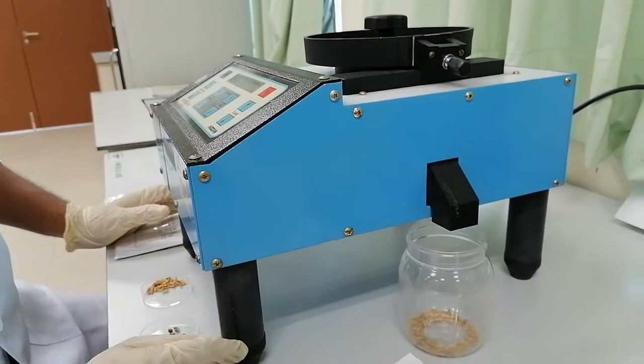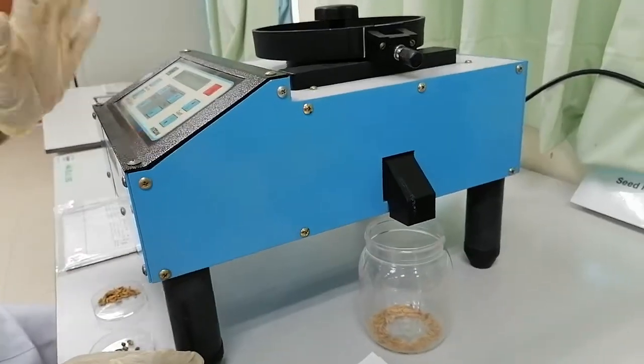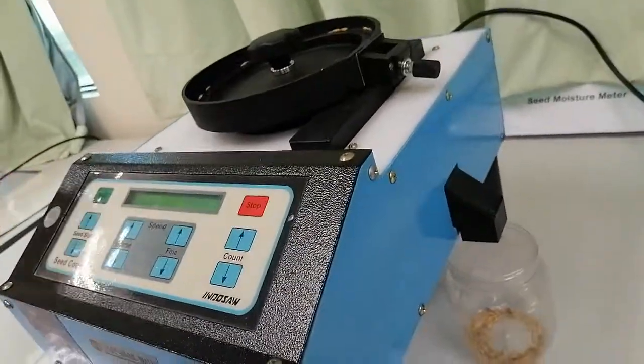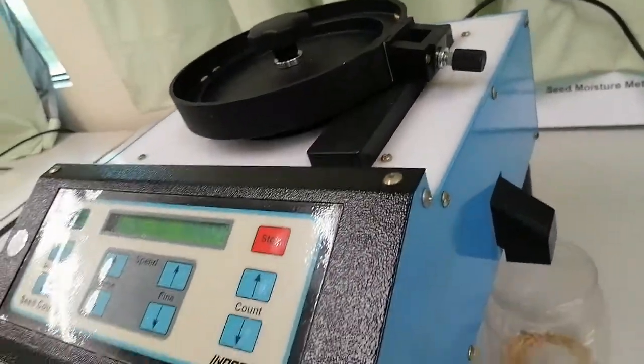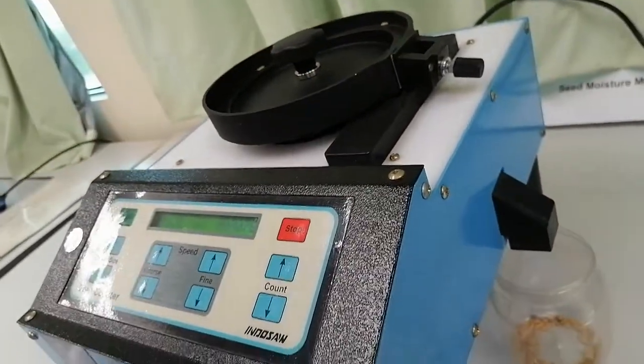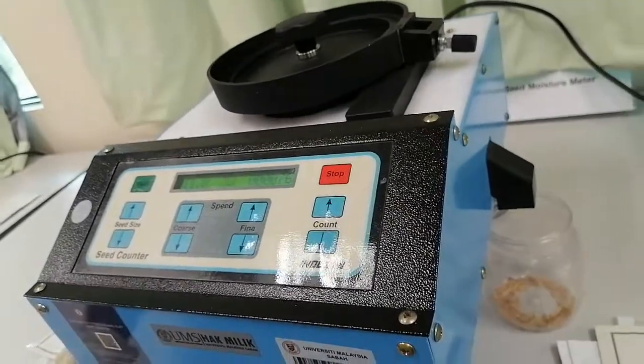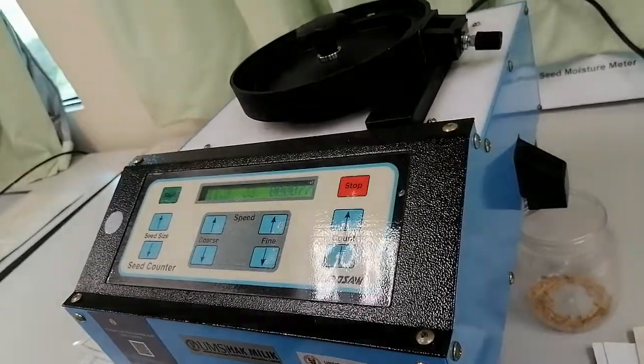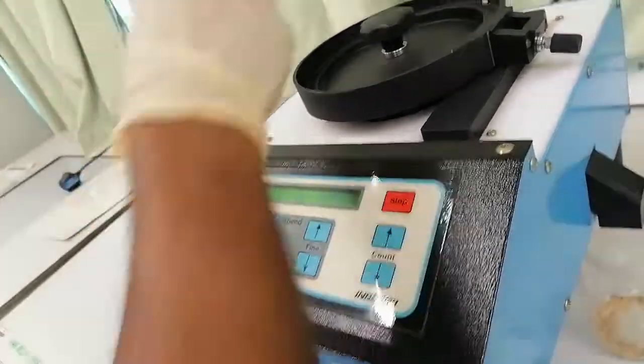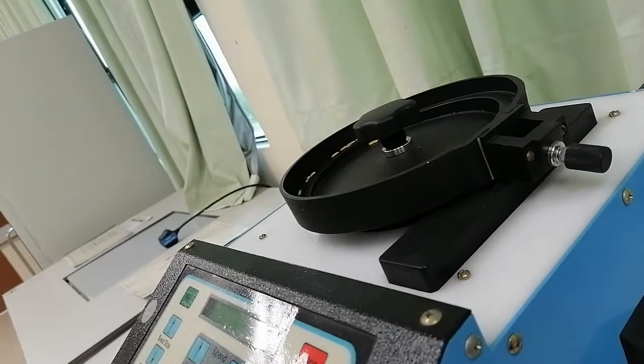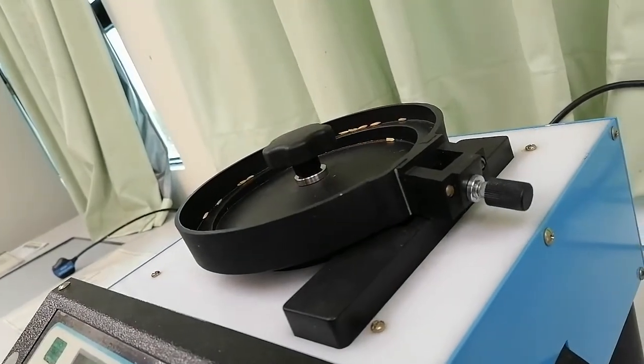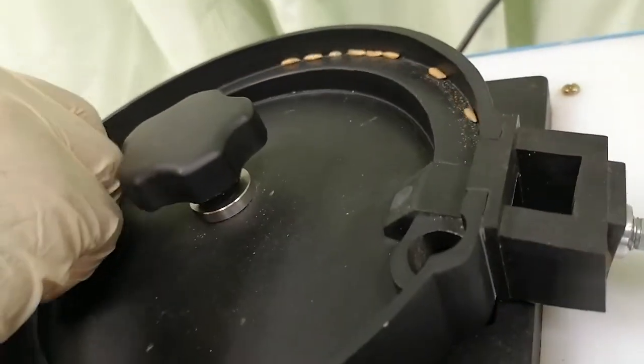You can see how seed is going and automatically counting here. Until 100 they will continue to move. When 100 reach, the machine will automatically off. This is the good facilities of that machine. That means 100. The seed is about to finish, so I am giving more seeds to reach 100.